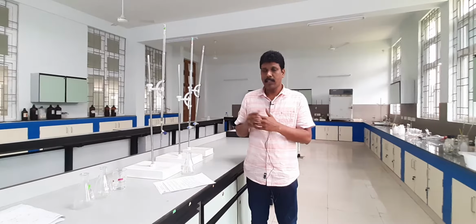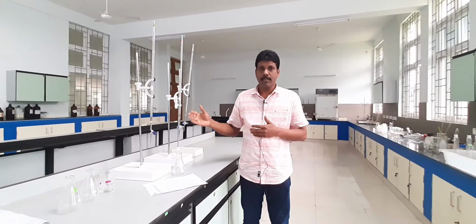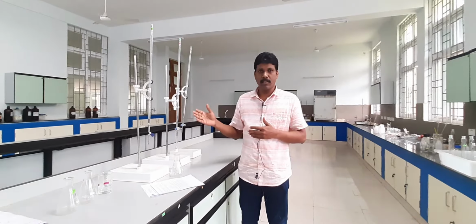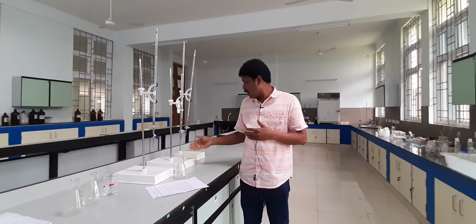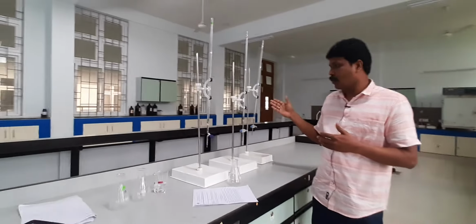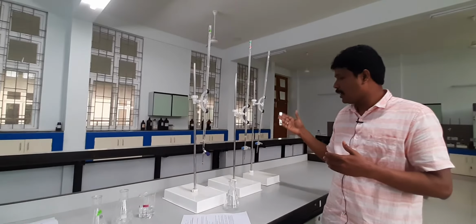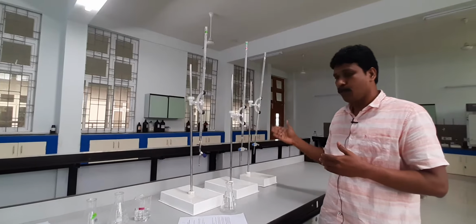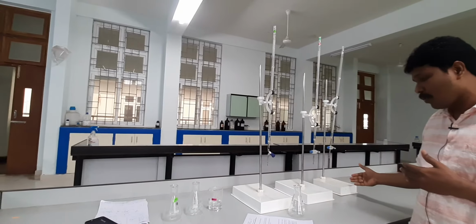And in this experiment, if you look at the procedure, we have to have 3 components in this phase rule experiment. The 3 components are acetic acid, water and chloroform. So, we have taken all these 3 liquid components in 3 different burettes. This is acetic acid, this is water and this is chloroform.